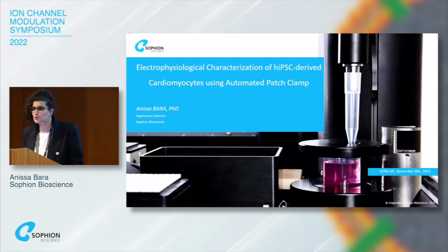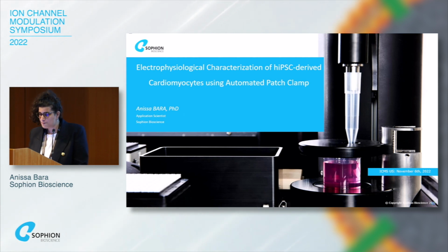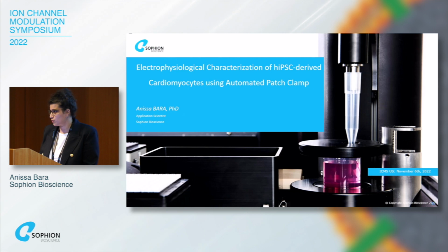Today I have the privilege to present a project that has been going on for a few years in our lab, and that is about the journey to develop some electrophysiological assays to characterize iPSC-derived cardiomyocytes using automated patch clamp systems.